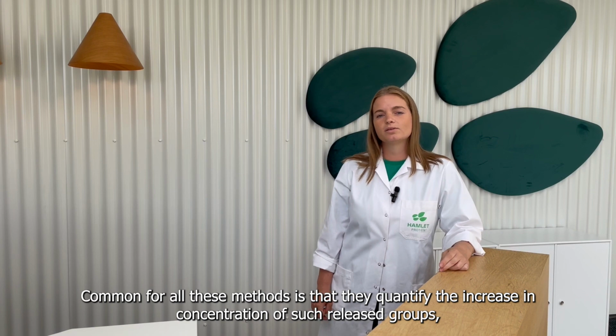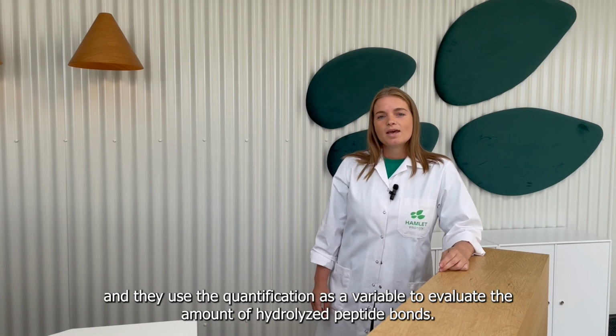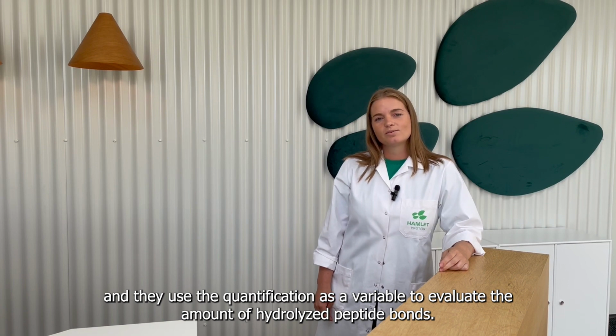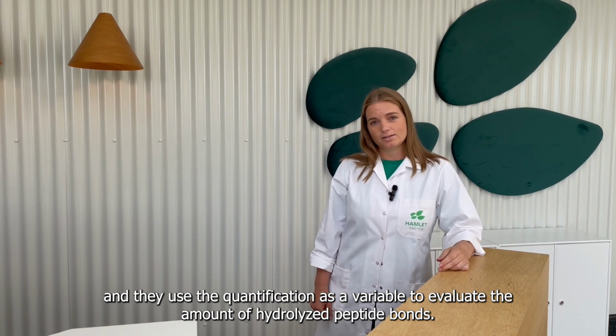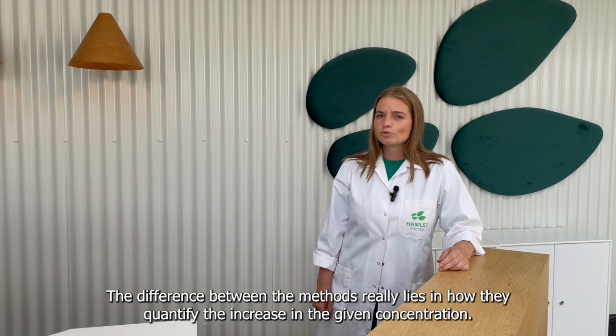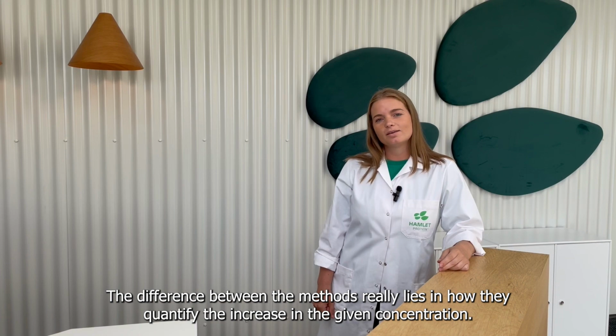Common to all these methods is that they quantify the increase in such released groups, and then they use this quantification as a variable to evaluate how many peptide bonds have been hydrolyzed. The difference between all these methods really lies in how they quantify the increase in such concentrations.